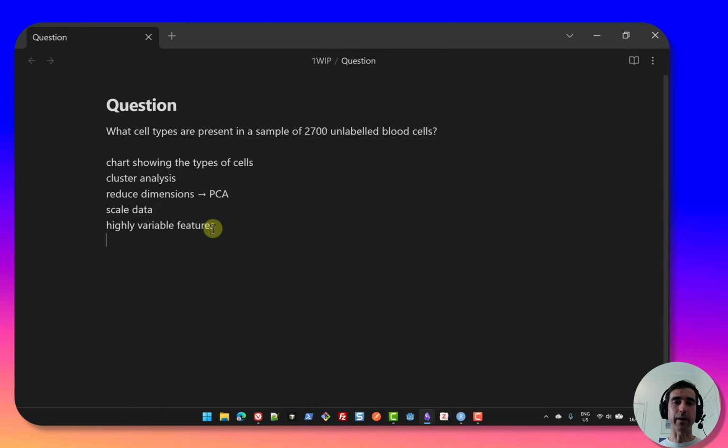And to compare different cells with each other, we're going to need to normalize the data. Are we going to normalize all the data? Probably not. There's going to be junk in there initially, so we need to remove the junk. And of course, if we're going to work with data, we need to load the data. Okay, so these are all of the reverse steps that we're going to take. So we're going to start from the bottom up. We're going to be loading the data, removing the junk, and doing all of those things.